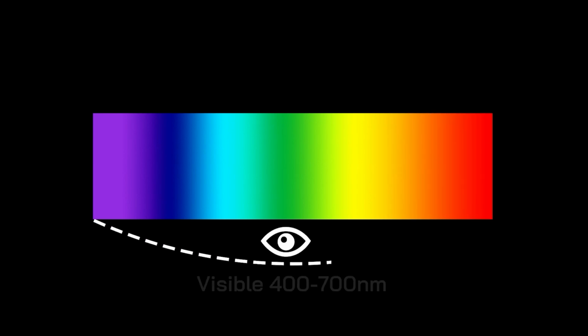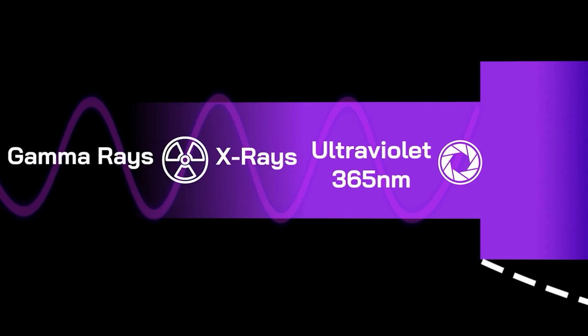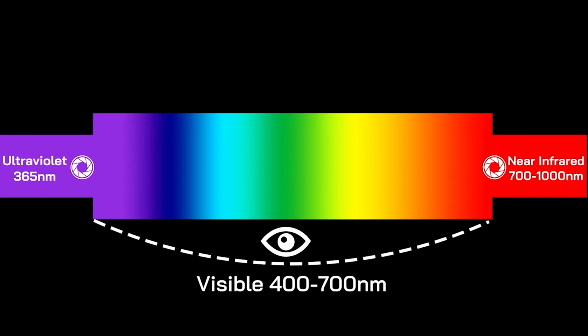So everything all the way from violet all the way through to red light, all combine together to make white light. Now, different surfaces will absorb and reflect different parts of this spectrum, and that's what allows us to see colour. It's for that reason that something like blood spatter on a white wall would look so obvious, because the wall would be reflecting all of that light back to us, and the blood would absorb quite a lot of it, and that's what would make the blood look dark.